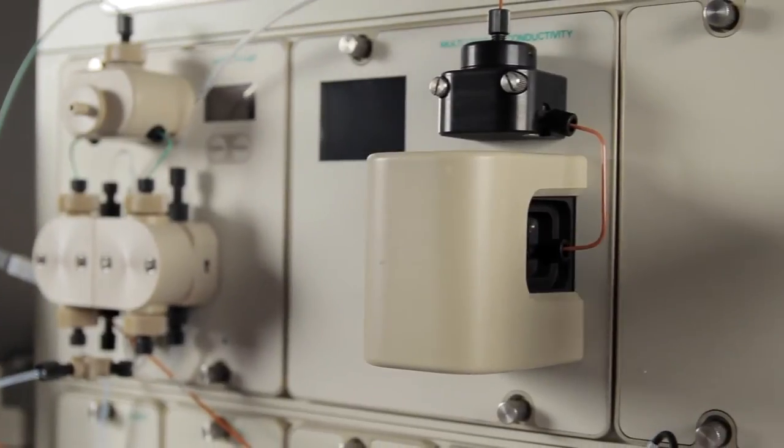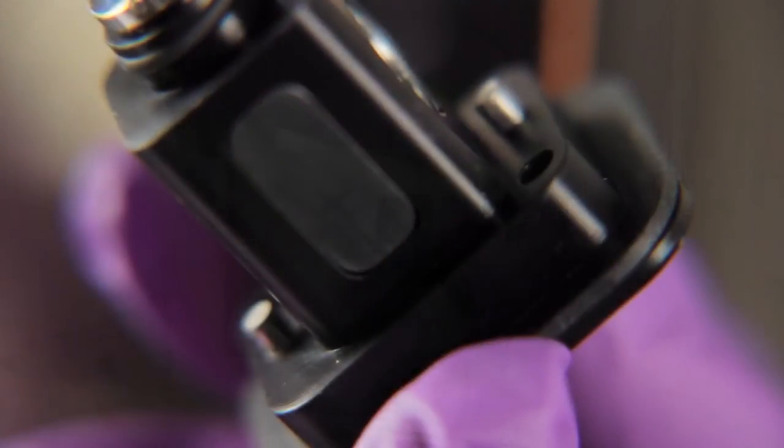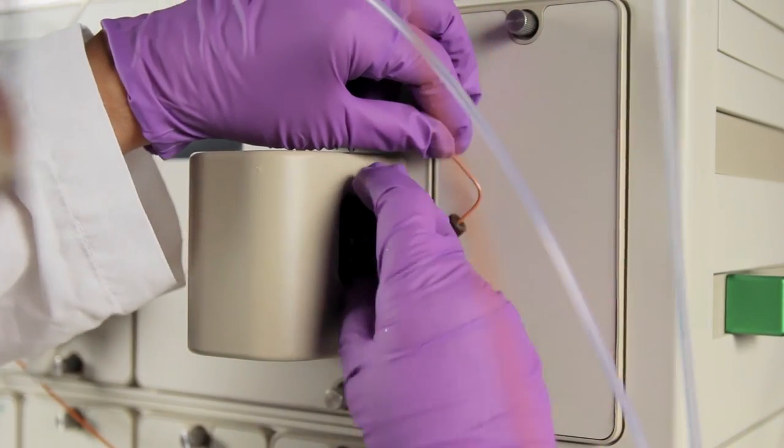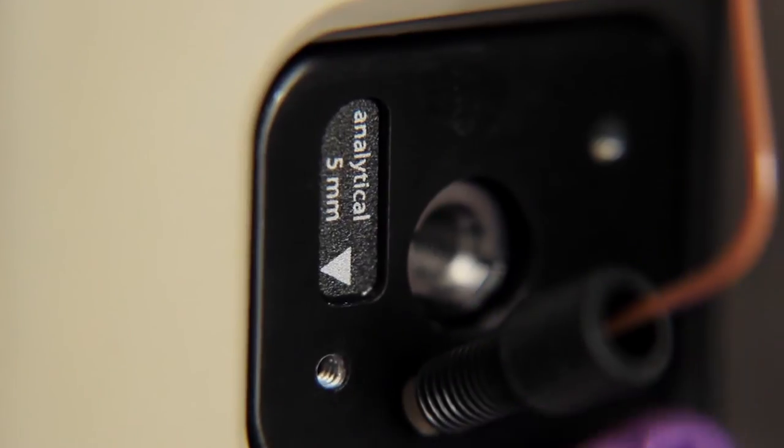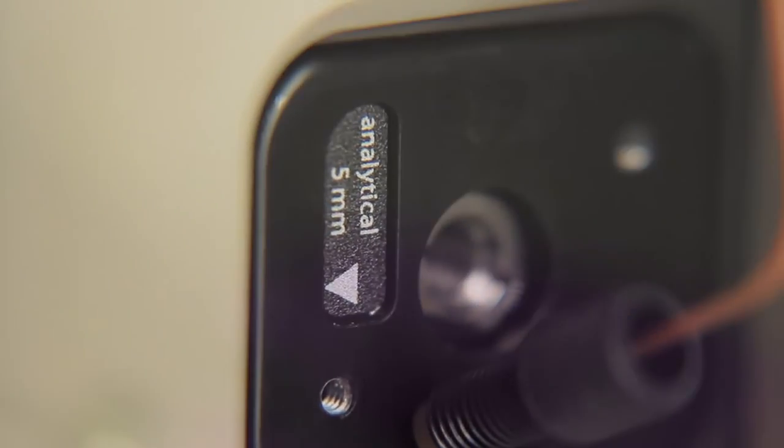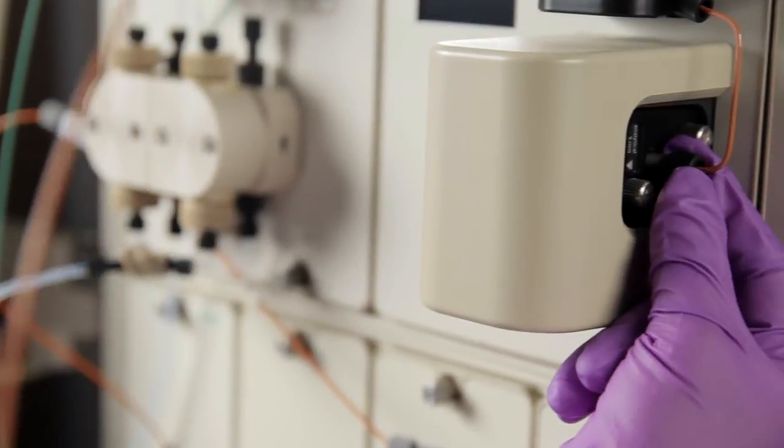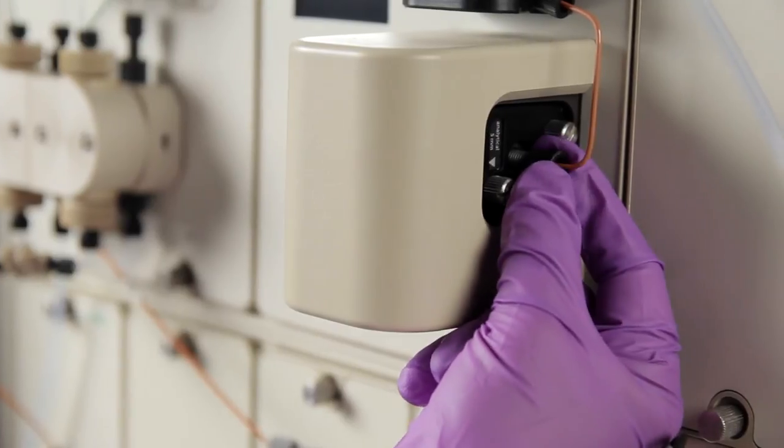Return the flow cell to its socket on the UV monitor, ensuring that the two bolts on the cell align with the holes in the socket and that the arrow on the flow cell is pointing to the left. The guides on the bottom of the flow cell will help you prevent inserting it incorrectly. Tighten the thumb screws and reconnect the 1/4-28 fittings on both sides of the flow cell.